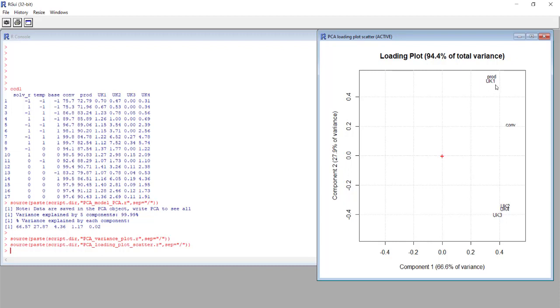And another observation that we can have from this plot is that the angle that is formed between these two groups passing from the center is almost 90 degrees angle. This means that these groups of variables are not correlated.